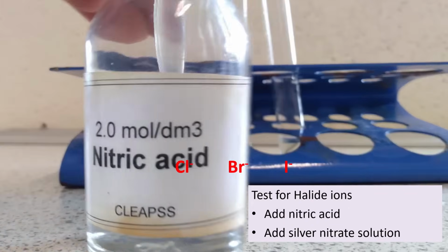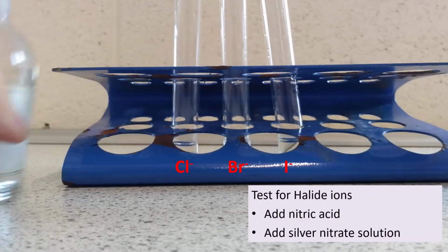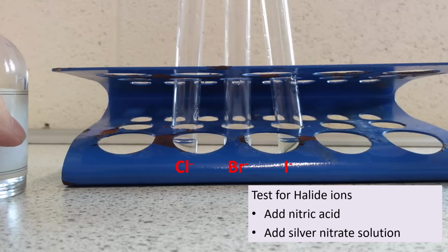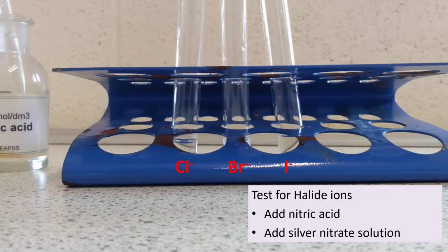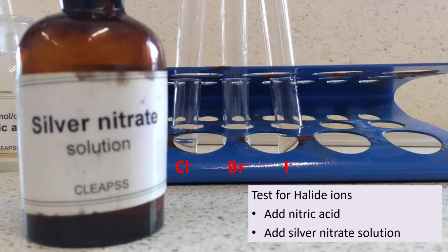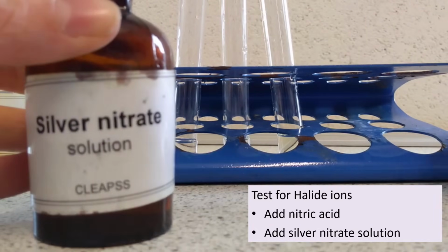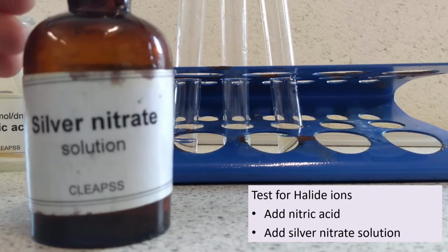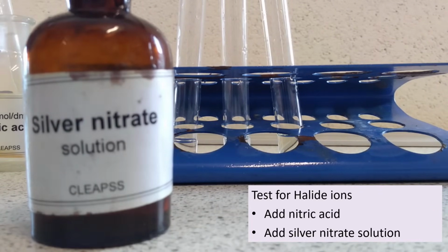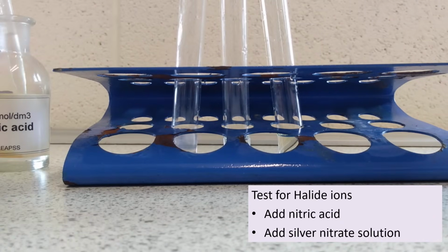We're going to start out and we add some nitric acid, and the nitric acid is in there to remove other negative ions that could give us a false positive. So we put a little bit of nitric acid into each tube, so any carbonates that are in there will react and disappear. And then to those, we're going to add some silver nitrate. So, for instance, if we have a solution that contains sodium chloride, then the silver ions will react with chloride ions and produce silver chloride, and we're going to see a precipitate. So, a little bit of silver nitrate to each tube.